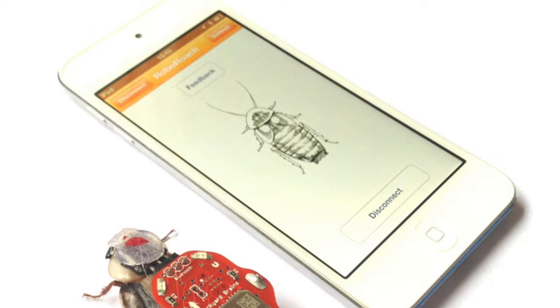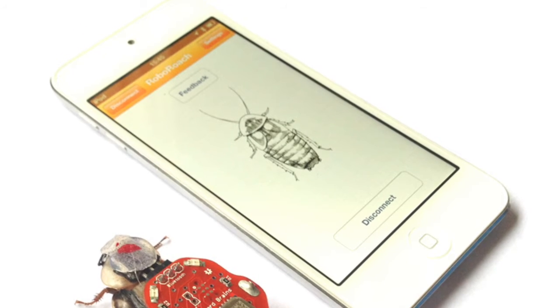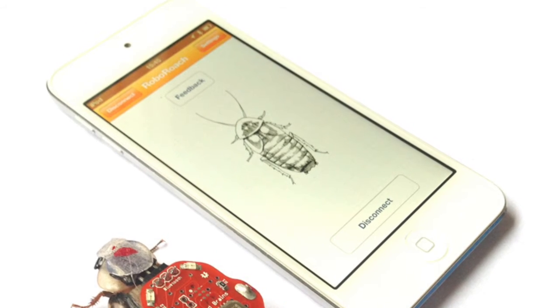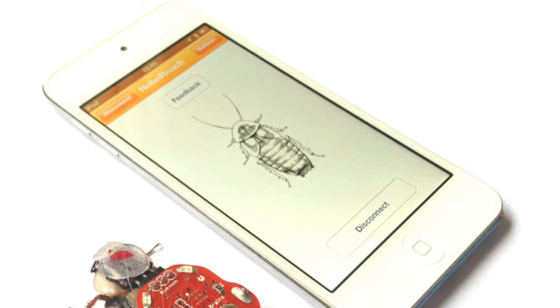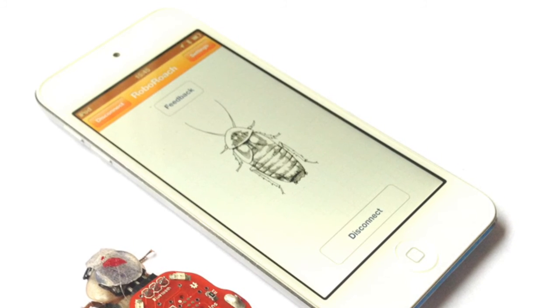Once connected, test if your surgery worked by trying to move the roach to the right or left side, which is done by sliding your finger on the screen in the way you want the roach to go. If both the right and left sides work with your control, congratulations, you have successfully completed the Roboroach surgery.